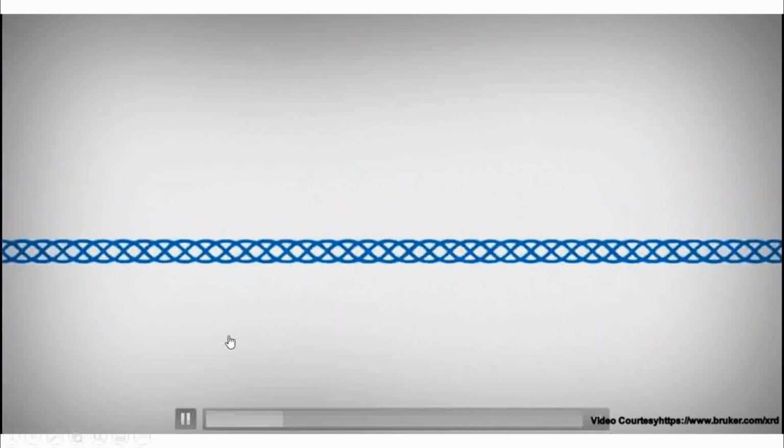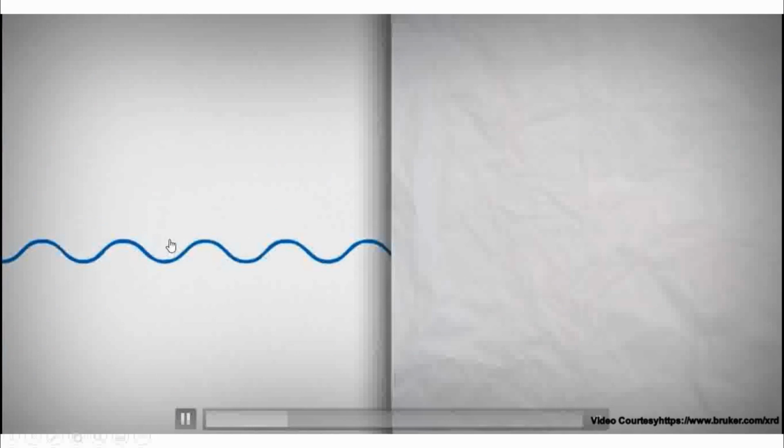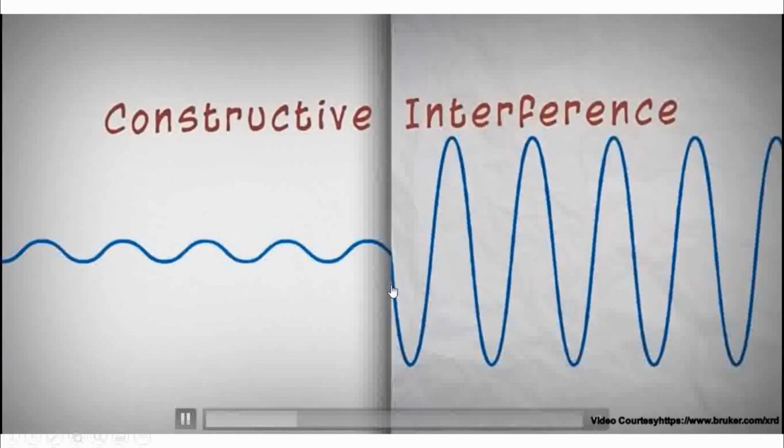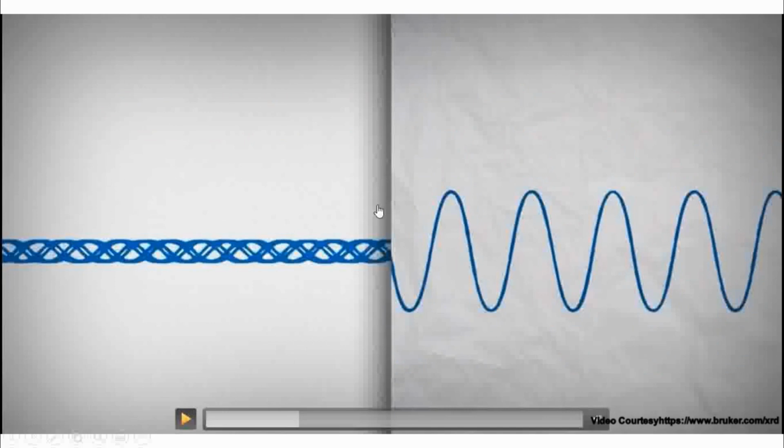And these diffractions can be constructive, so you have multiple wavelengths falling constructive and you're getting a higher interference. You see, this is called a constructive interference. You have a lot of wavelengths and they are constructive because the phases, the peaks, are matching with one another, and that is why the resultant amplitude is high.